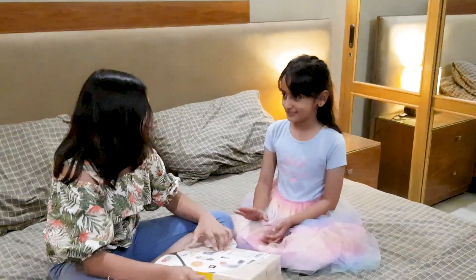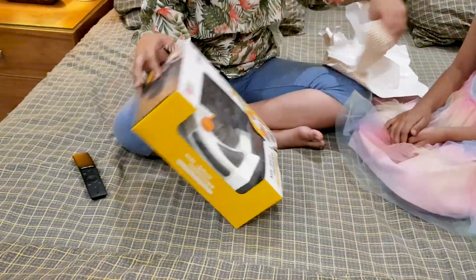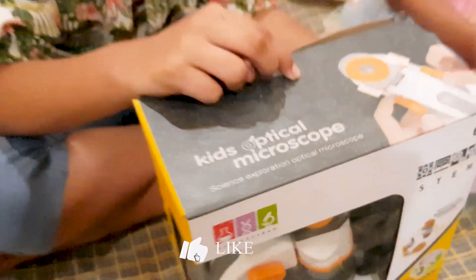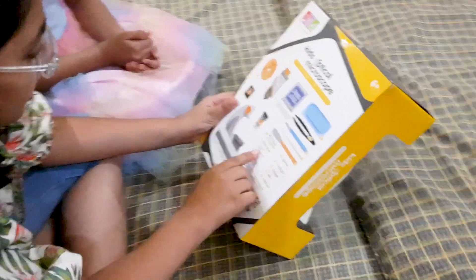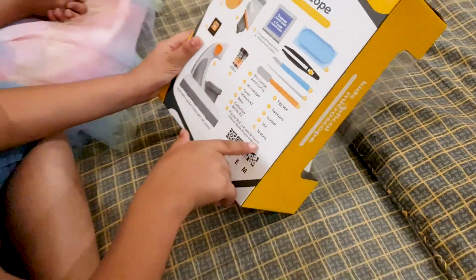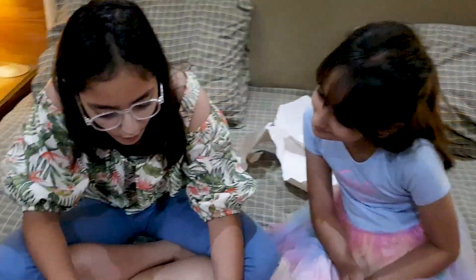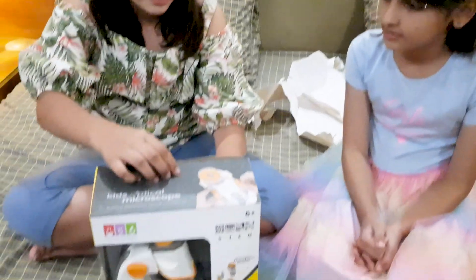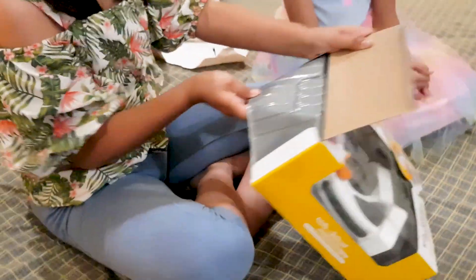Whoa, slow down. I'm too excited. Oh, thank you so much. You're welcome. Come, let's open it together. Wait, before we open it, let's see what is included. Let's open it now. Let's open it.